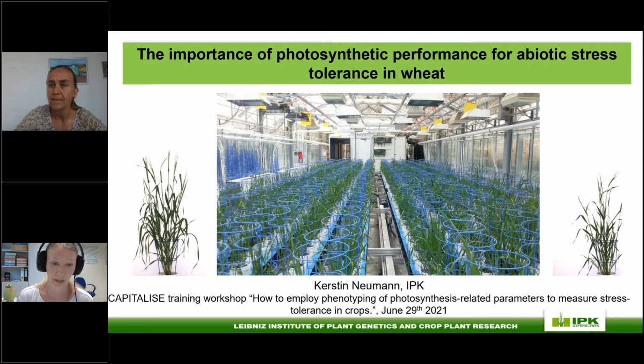And we have done some studies involving photosynthetic performance in cereals in the past years by having an expert on photosynthesis here, and I want to introduce you a bit to the results that we have obtained during these high throughput experiments, focusing here on the aspect of drought tolerance. You see here on the image a view into the greenhouse where one of the high throughput systems is located. Here are the imaging towers for those who have not been at IPK yet.